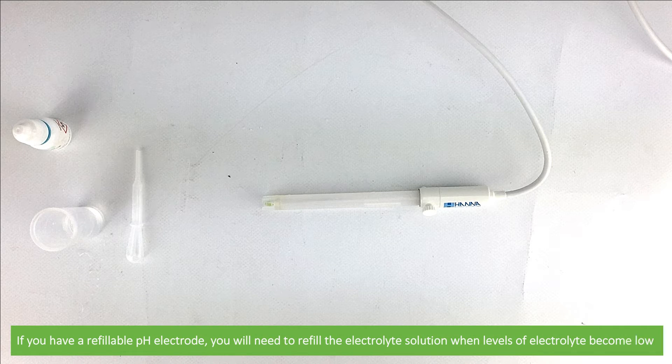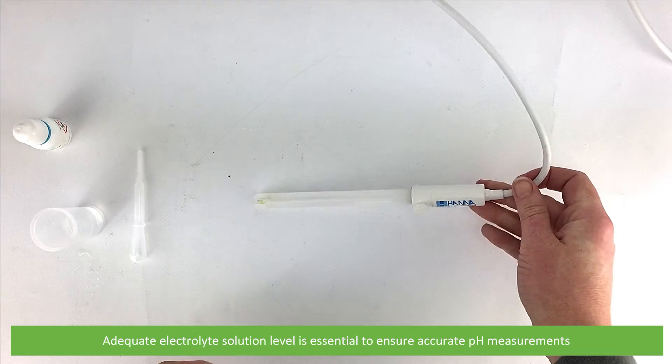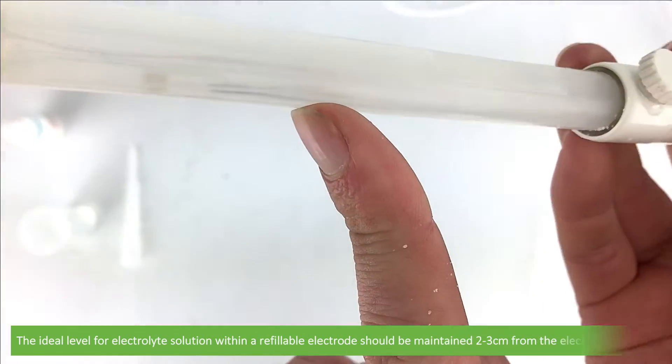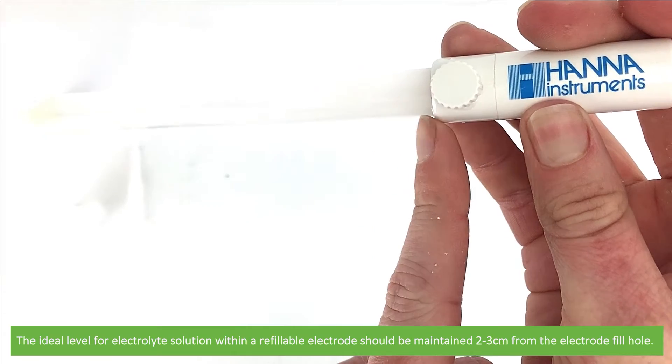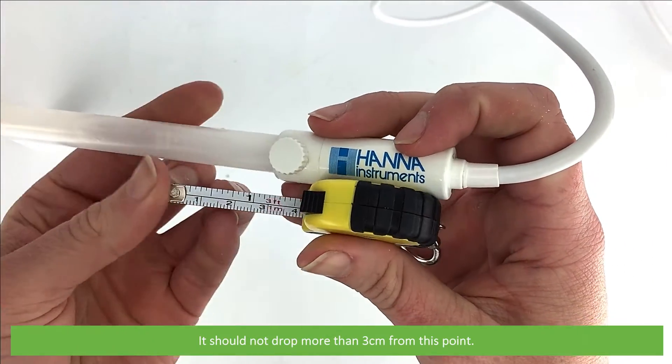If you have a refillable pH electrode, you'll need to refill the electrolyte solution when levels become low. Adequate electrolyte solution level is essential to ensure accurate pH measurements. The ideal level for electrolyte solution within a refillable electrode should be maintained 2-3cm from the electrode fill hole. It should not drop more than 3cm from this point.